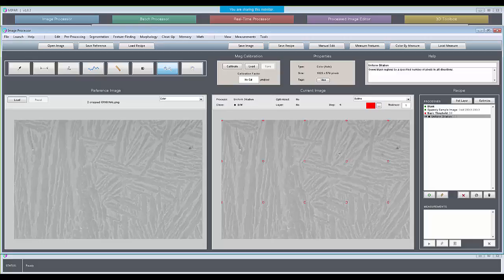So some have asked us, when you're doing computer-aided analysis now, should you be point counting your segmentation for area fraction analysis, let's say, or should you just be counting all of the pixels of your segmentation?